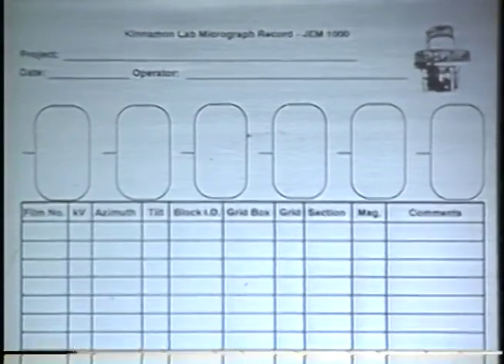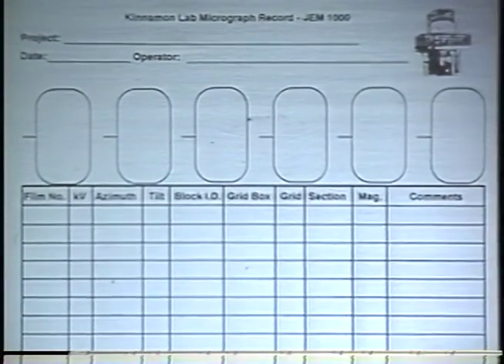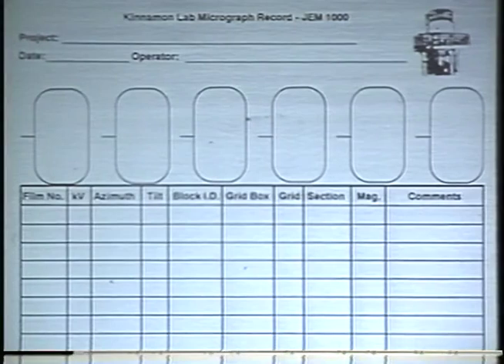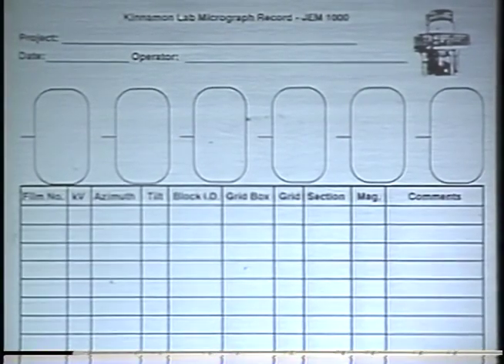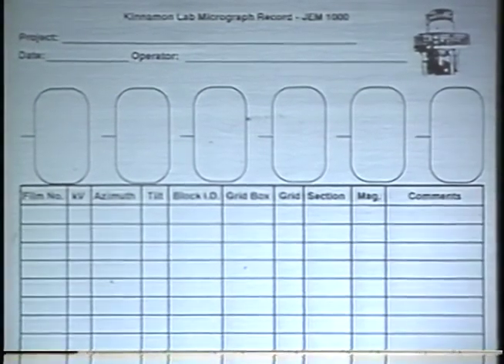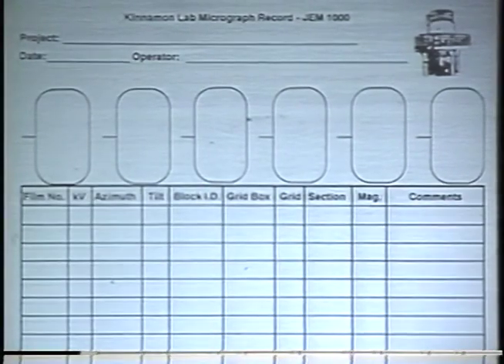I have little slots up here so that for each grid that I look at, we can draw a picture of the locations of the sections and maybe number the sections, so that later on, a year from then, if we wanted to go back to a particular grid and a particular section, we could do it with a minimum of trouble. There's nothing really new and exciting here, but this just facilitates the record keeping, which is so important with the things that we do.